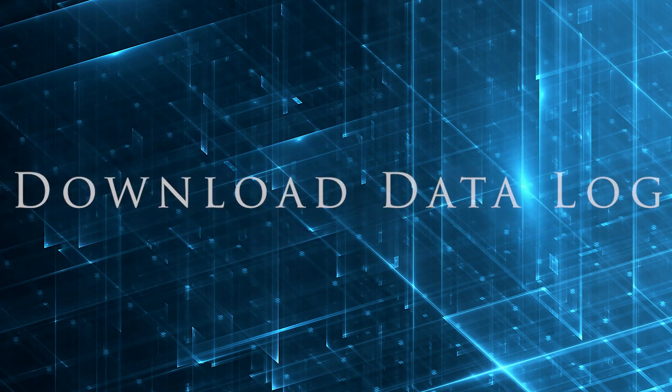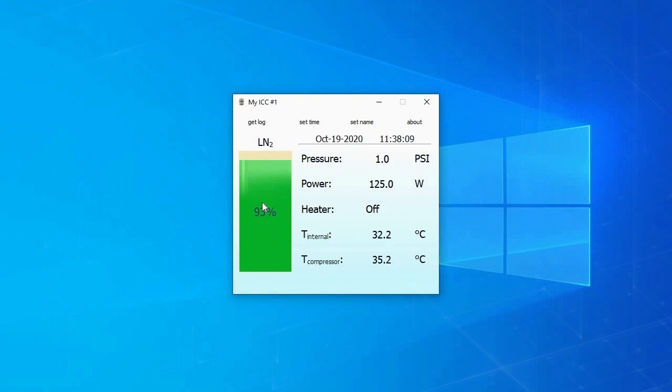From the moment the Intelligent Cryo-Cycle unit is powered, it records each minute of all recordable parameters, the fault status, and the operational status in its onboard memory storage. Sufficient memory is provided to keep track of about 4 years of data. As a result, you will always have a complete picture of the unit's state of health.